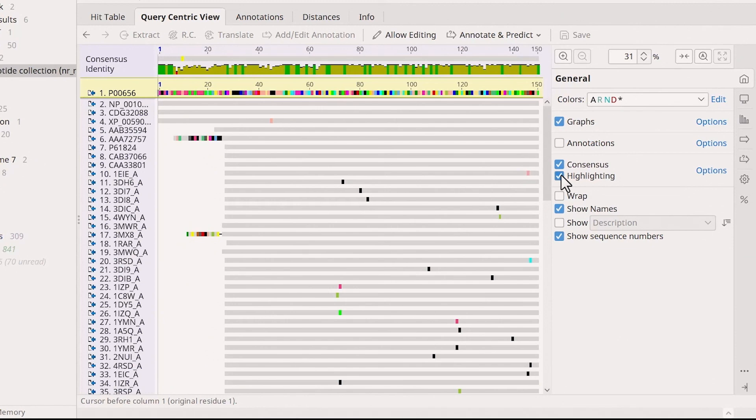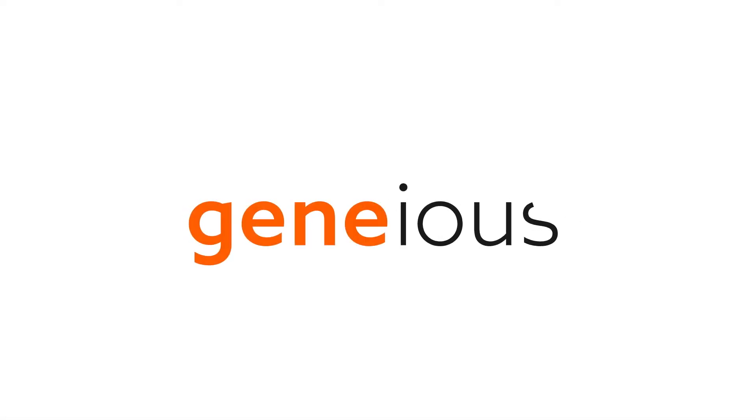And that's how you perform BLAST searching. To learn more, visit Geneious.com.